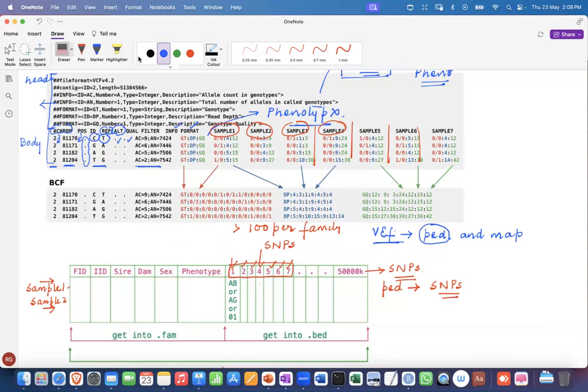See, the 6 columns that are there, right? The first one, the samples, the major difference. We committed a mistake. So now you'll remember this fellow initially committed a mistake and then corrected himself. I do it this way so that you remember, yes, the mistake was committed purposefully to make you understand. In the VCF the samples are in the form of columns. Now the samples are here in the form of rows, right?